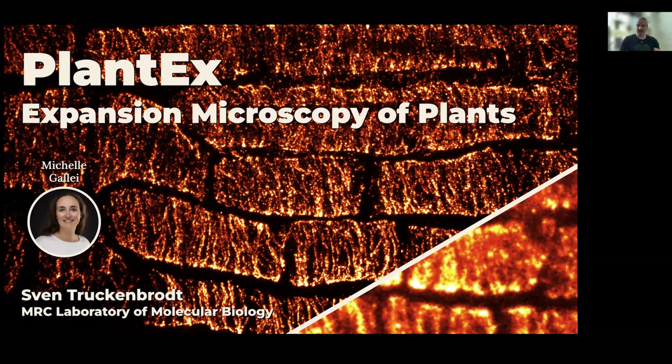She was an extremely talented PhD student at the Institute, did a lab rotation in our group, and well, as Alex already disclosed, I have no idea about plants. I've never worked with plants. I only know how to water them in my house, but that's about it. And Michelle is a real expert in Arabidopsis biology, and so we tried to see what can we do together. Can we combine expansion microscopy to use it on plants? And this is how this whole project came about.